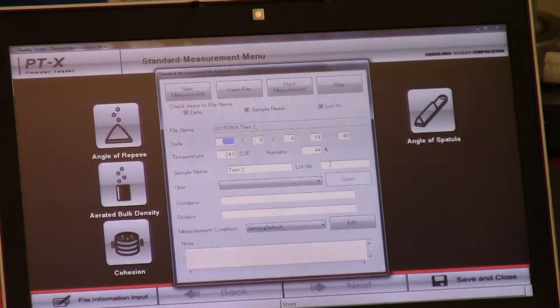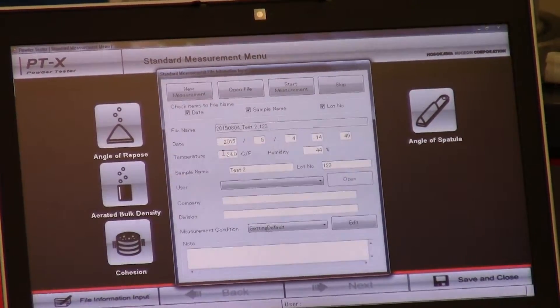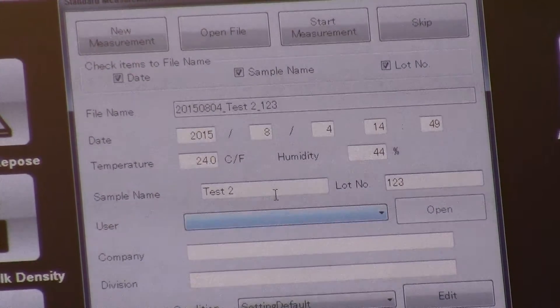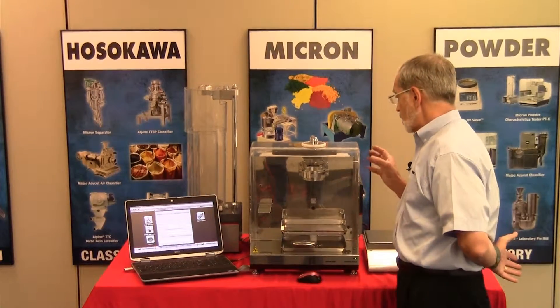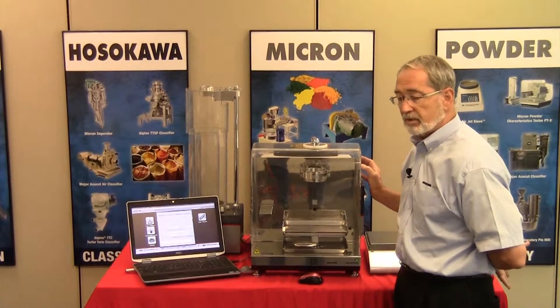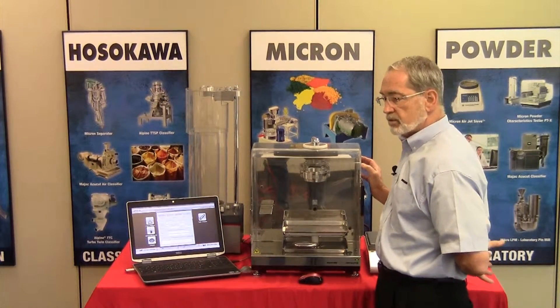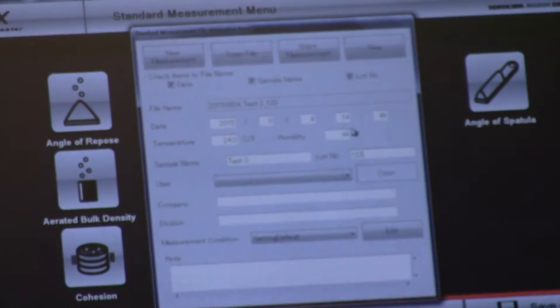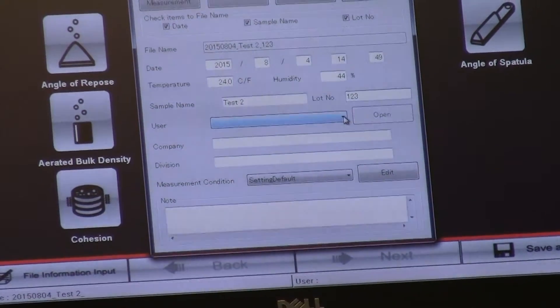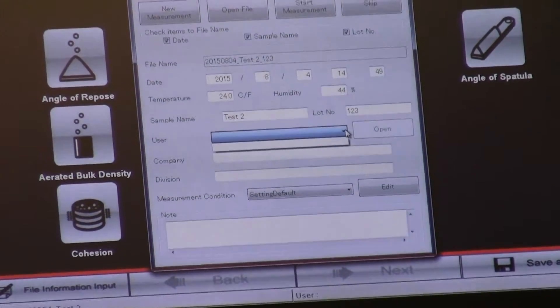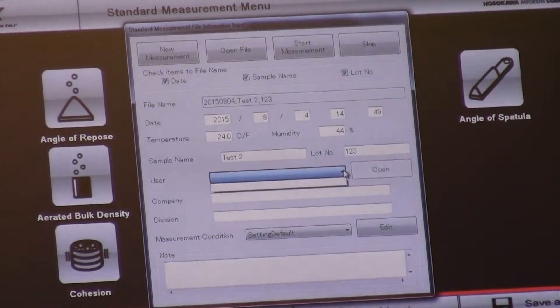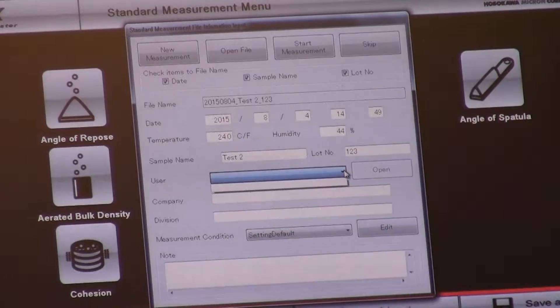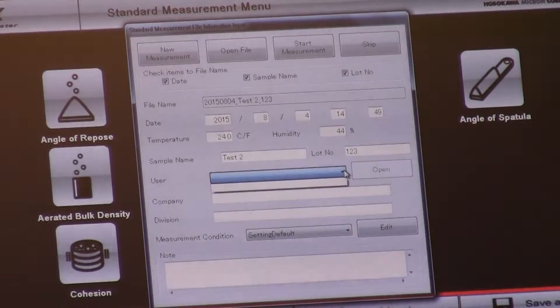Once you put in the date, the sample name, and lot number, it will populate those fields — as you can see it just populated in the field here. One important thing is that the machine does not have the capability to determine the temperature of the location where the instrument is located, which can have a critical effect on various powders, especially if they are hygroscopic. So we identify the temperature and the relative humidity. You'll also note it has the ability, depending on how many people have been assigned rights to work with the instrument and their capacity — administrators, technicians, and various users — they will have certain levels of ability to change some of the parameters.